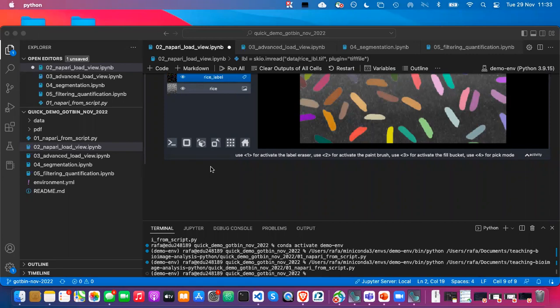And also, because Napari is a real 3D or multi-dimensional viewer, you can have 3D and time, which is kind of nasty in Fiji. But Napari was really built for that. So out of the box it is very good at 3D and time. You can also do very nice videos and exports of videos of exploring data sets in 3D and time or different things. Okay.